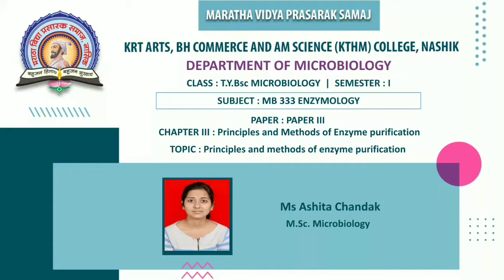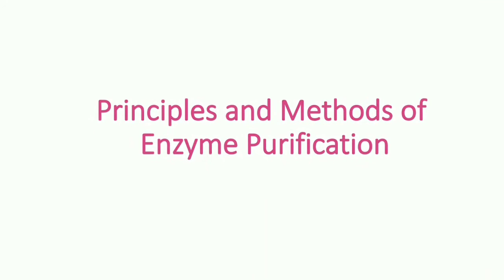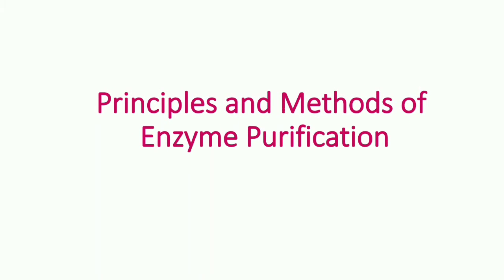In this video, we'll be talking about principles and methods of enzyme purification by using the property of molecular size. So before we move on to today's main topic, that is purification on the basis of molecular size, let us revise in brief about the topics covered in the previous video.